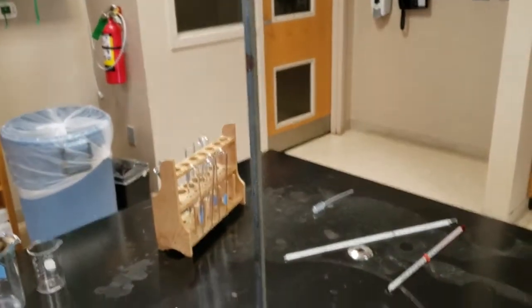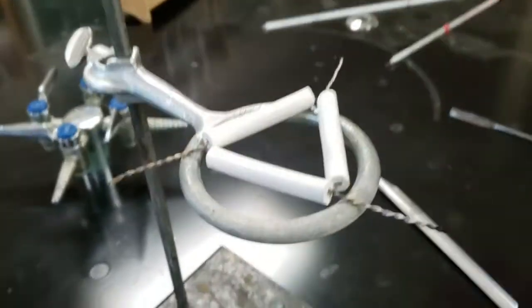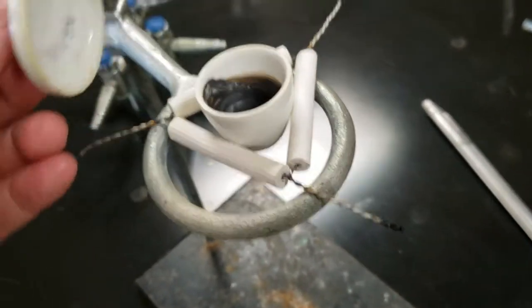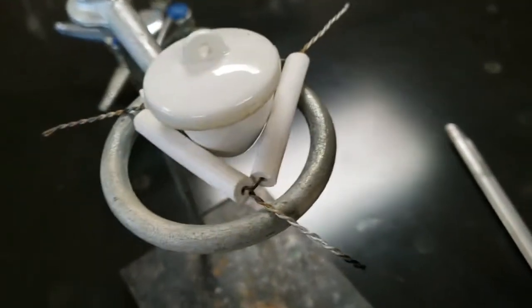Here's a ring stand with a ring. It's got a ceramic triangle because it's ceramic and it's a triangle. And those can get really hot with no problem. Sitting on top of it is a crucible with a crucible lid. They also can get very hot. We will use these several times throughout the year.